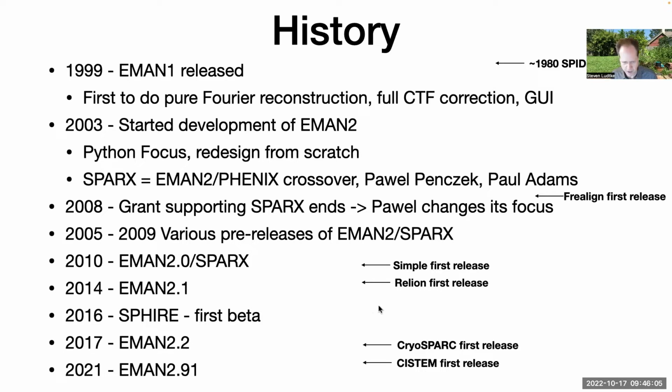You can just sort of see where various things happened over time. Obviously, recently, we've seen Relion and CryoSPARC sort of taken over the market for single particle analysis anyway. Relion is also getting into subtomogram averaging, having absorbed some of the developments by other groups which tried to tack that capability onto Relion. But there's still some competition in the subtomogram averaging field.